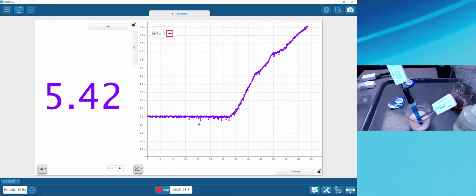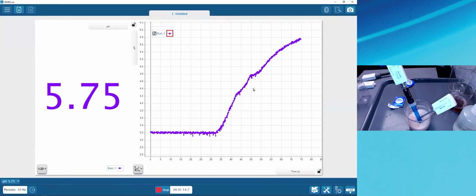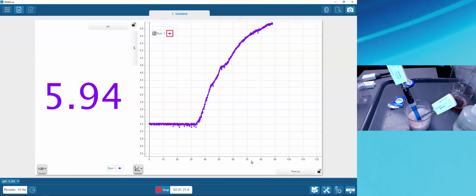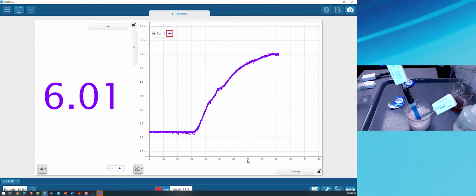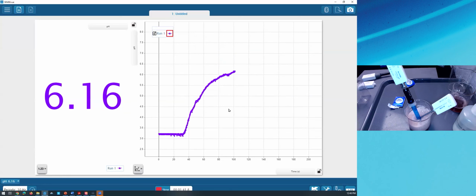Now, we've already noted that the graph itself is scaling the axes automatically so that all the data is visible. I can also take control of how this graph is scaling. One of the things I can do is simply click and drag by default in the middle of the graph, and I can pan this graph around as if it's a sheet of traditional graph paper on the tabletop. Something I can't do with a traditional sheet of graph paper is I can click and drag on the axis number labels, either the y-axis or the x-axis, and you notice it's shrinking and expanding the graph as if it's made of rubber. So through a combination of moving in the middle of the graph and scaling on the graph axes, you can get the view of the data that you want.